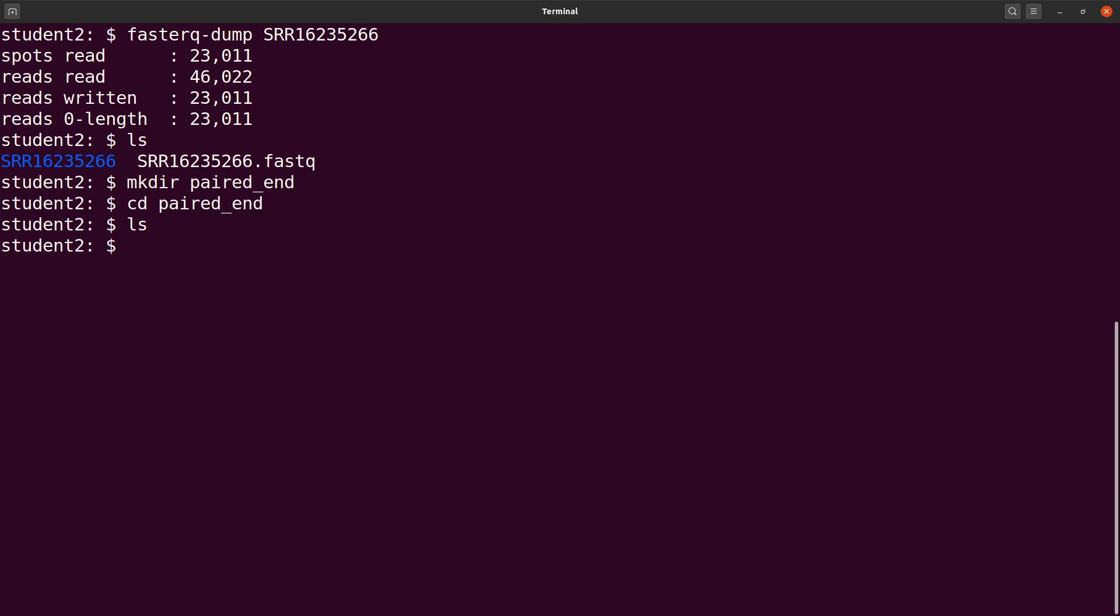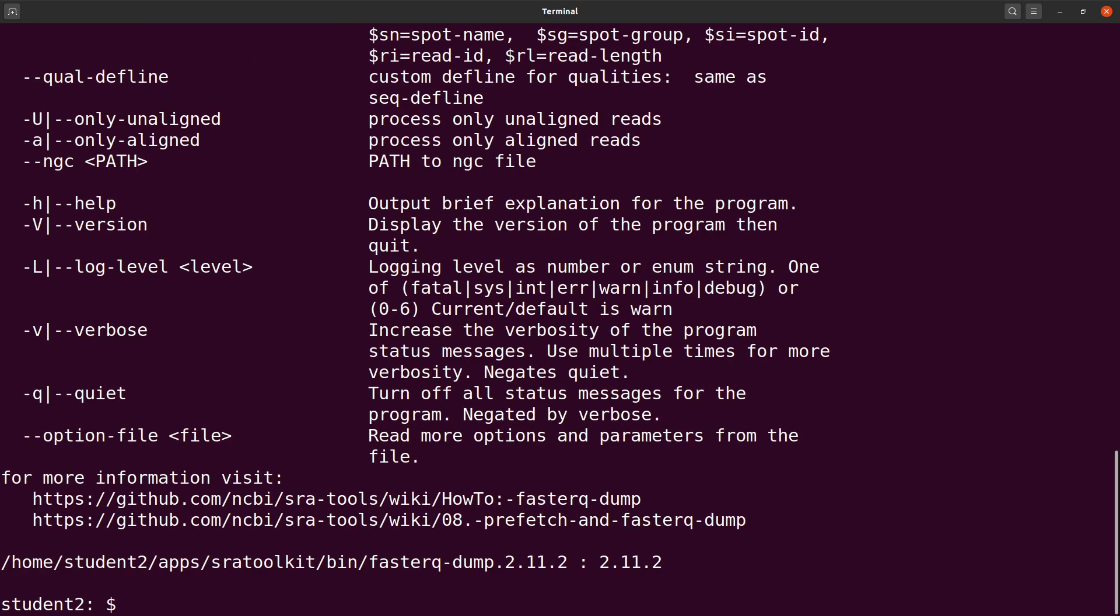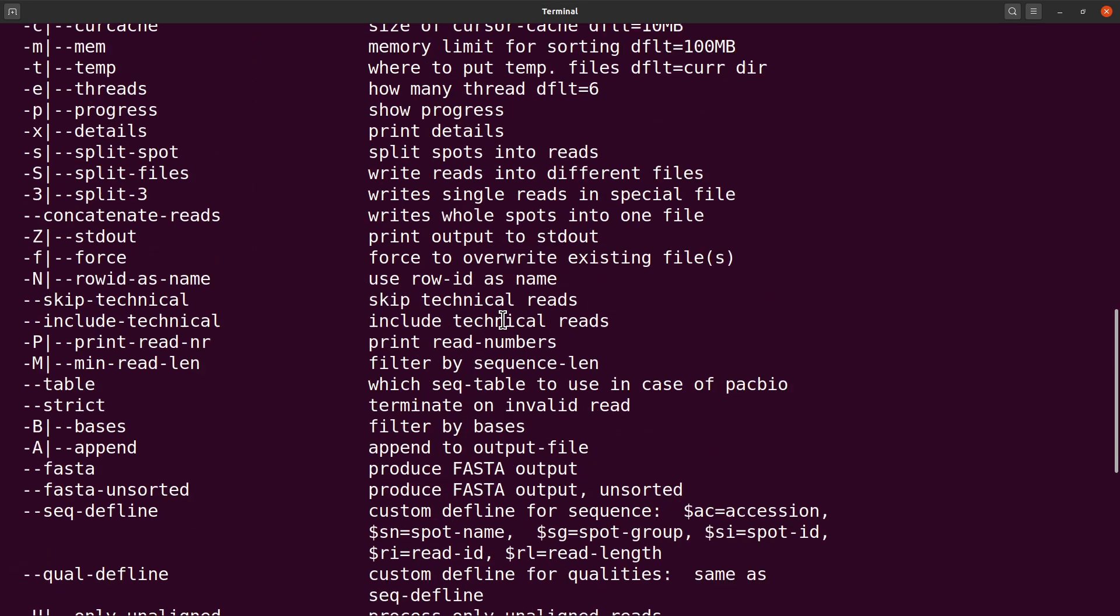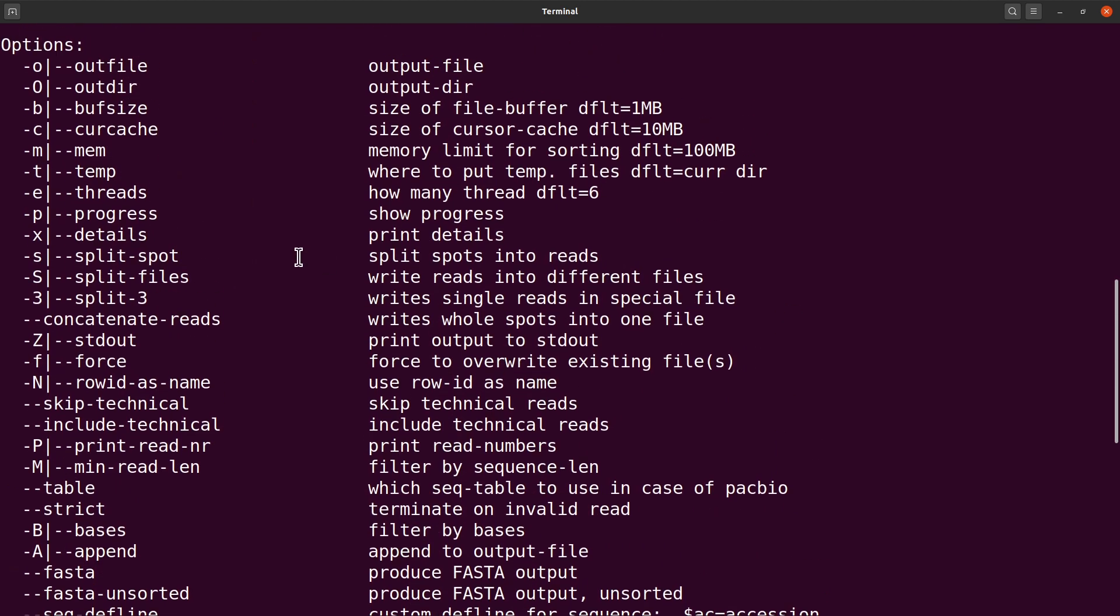With paired-end there are two options you can choose from: you have the split-files and the split-3. Let's look at the options here first. So let's type fastq-dump, so you have some information here.